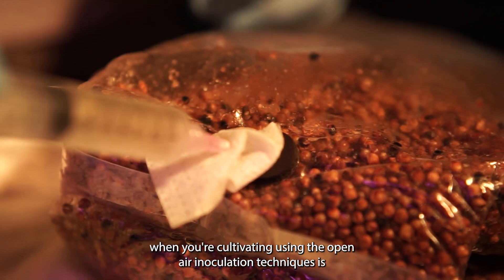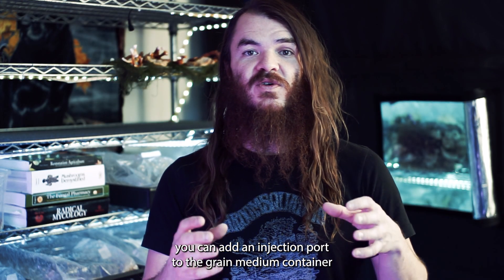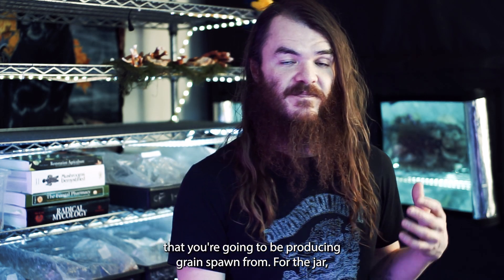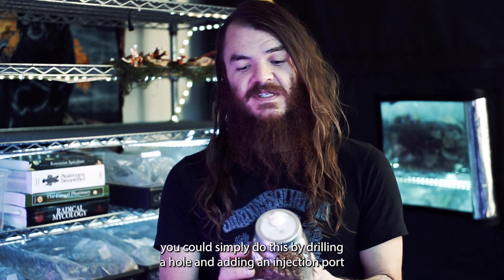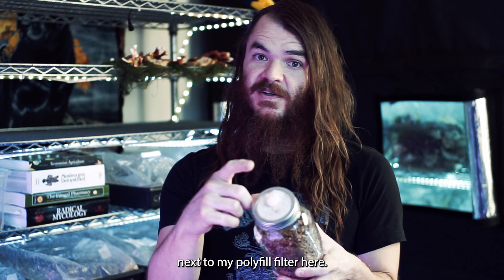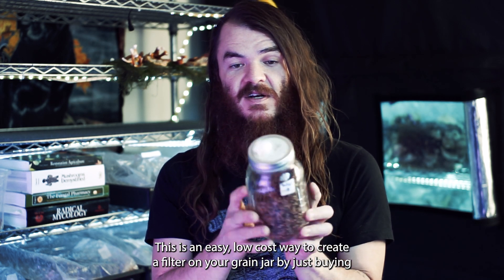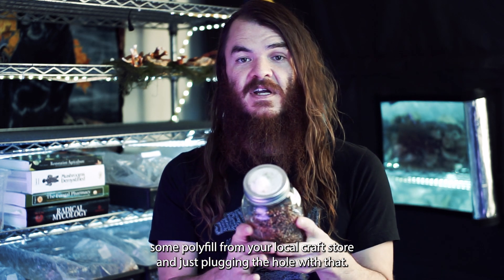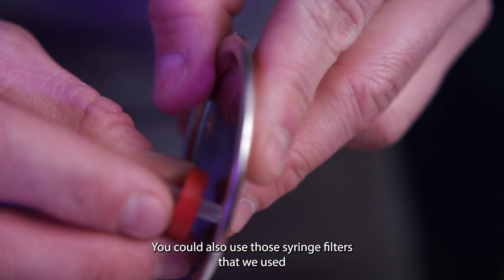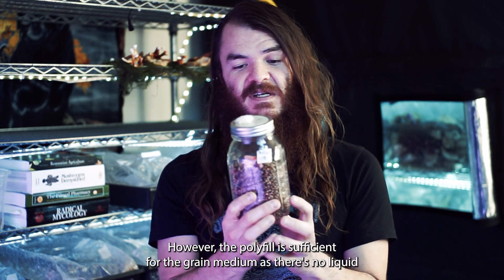When cultivating using open-air inoculation techniques, you can add an injection port to the grain medium container. For the jar, you can do this by drilling a hole and adding an injection port next to the polyfill filter. This is an easy, low-cost way to create a filter on your grain jar — just buy polyfill from your local craft store and plug the hole with it. You could also use syringe filters like those used for liquid culture, however polyfill is sufficient for grain medium.